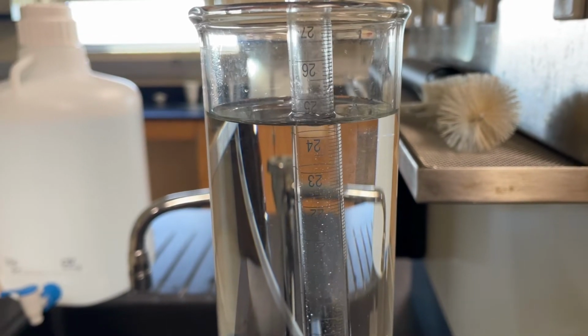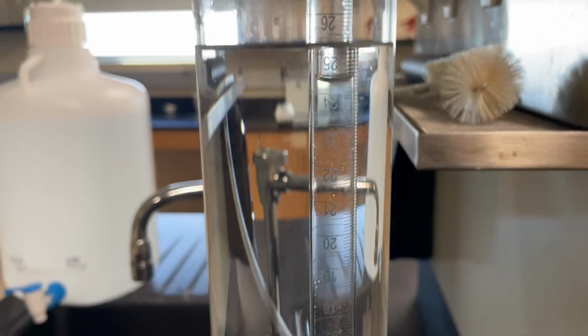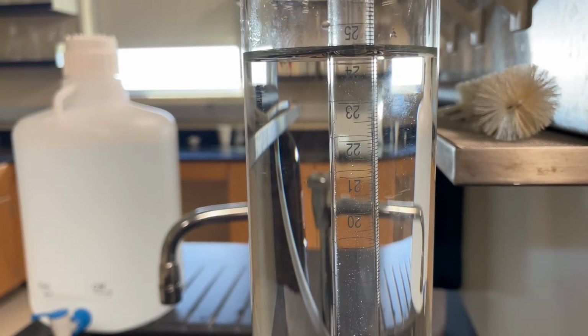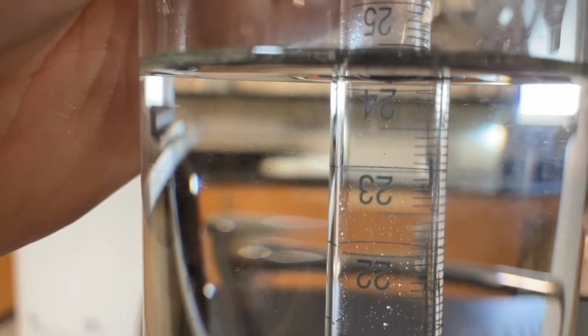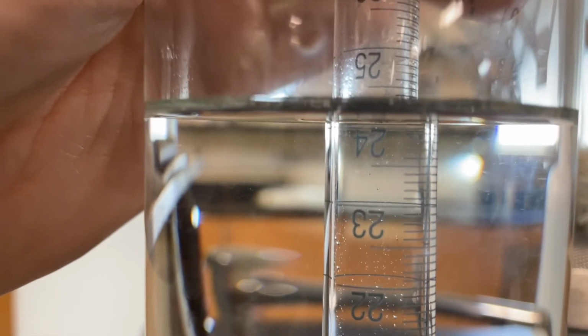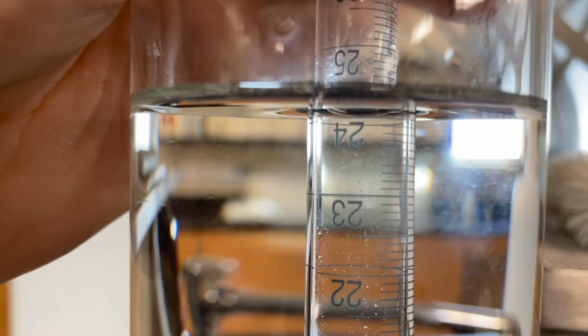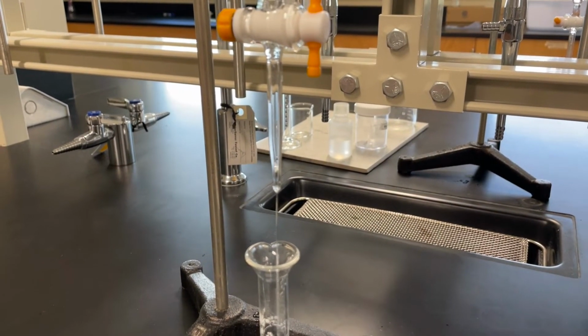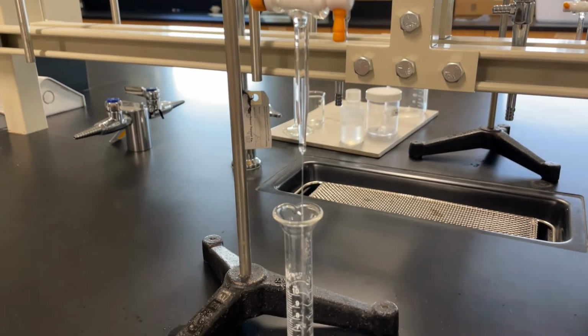You may have noticed at the beginning of this video there was a quick photo that showed the current temperature and current pressure of the room. That's also the current temperature of this water, which is important for gathering the vapor pressure of the water. Please note the units that it was presented in, because you will need to convert that into applicable units.